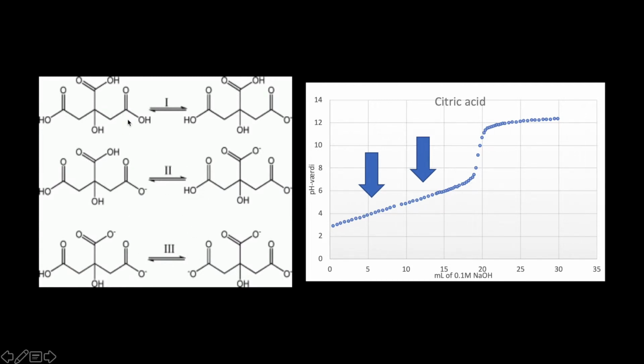For the first reaction we have normal citric acid in an equilibrium where it makes a weak acid, so this is still an acid, and then it turns into another acid, which turns into a weak base. This is when the pH value changes, when the endpoint is reached, at the third reaction.